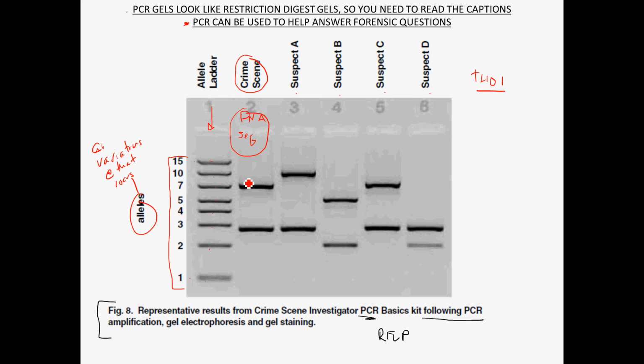And it turns out that at the crime scene, we were able to amplify a sequence that was complementary to allele number 7, and then this is most likely allele number 3 here. So the DNA that was at the crime scene, that is not the victim's DNA, had this allele and this allele present. Are these other alleles present there?